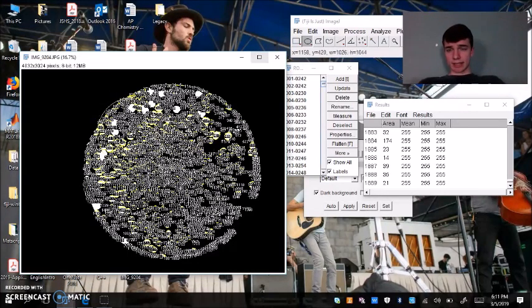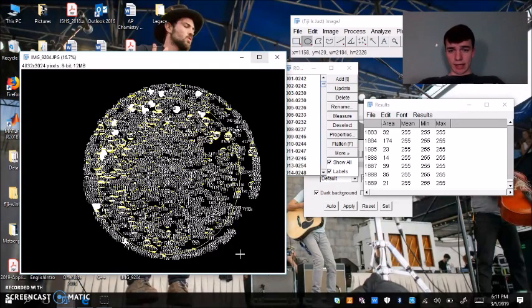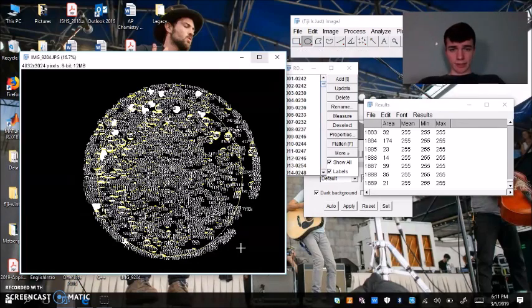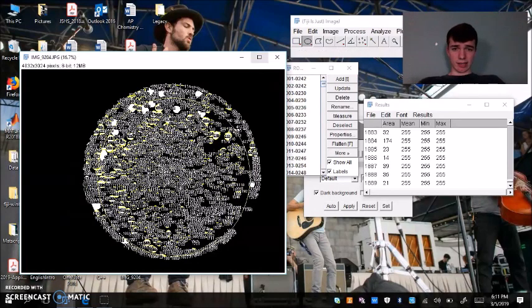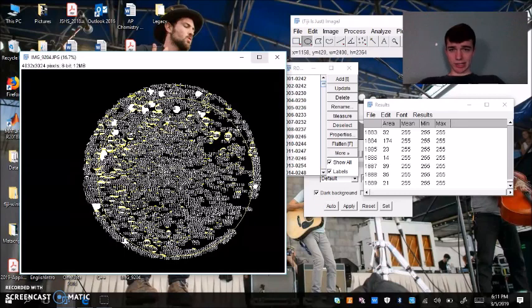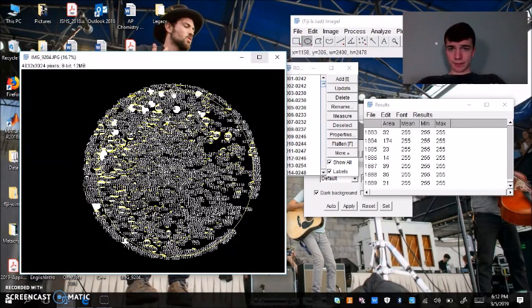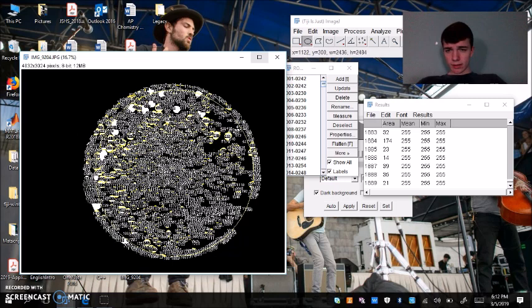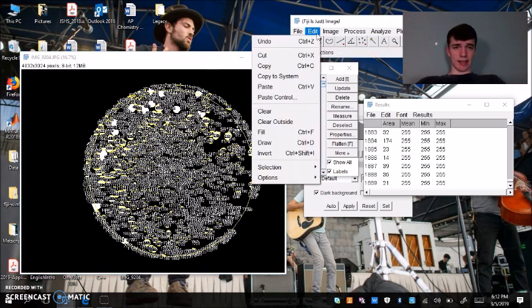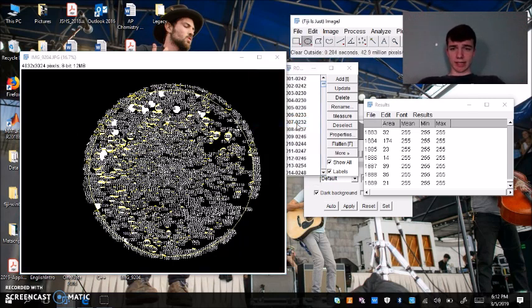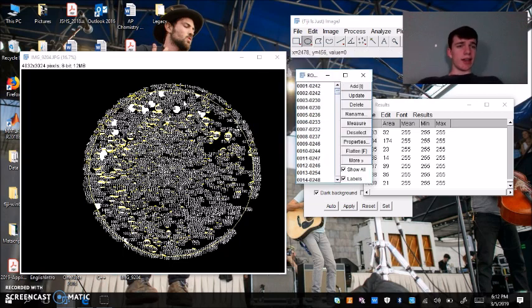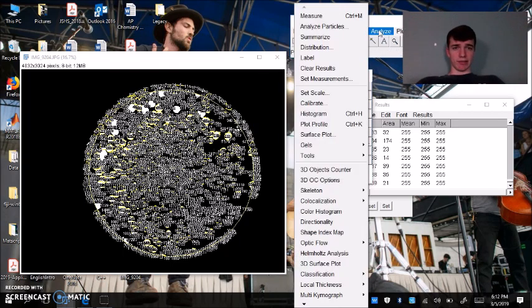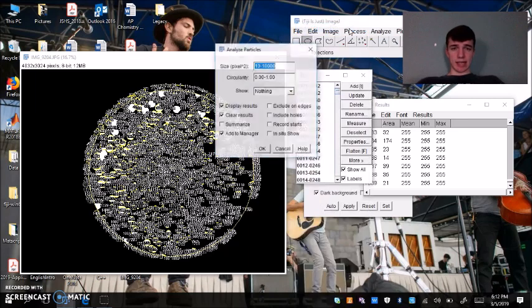Let's say, take my circle tool and I exclude the colonies that ImageJ counted on the edges. Again hit edit, clear outside. So now that I've resized my region of interest, I can go back to analyze, analyze particles.